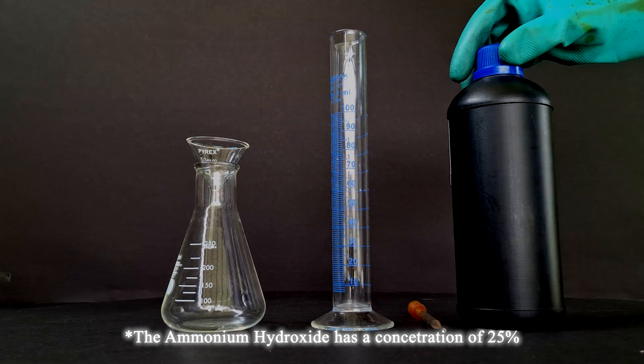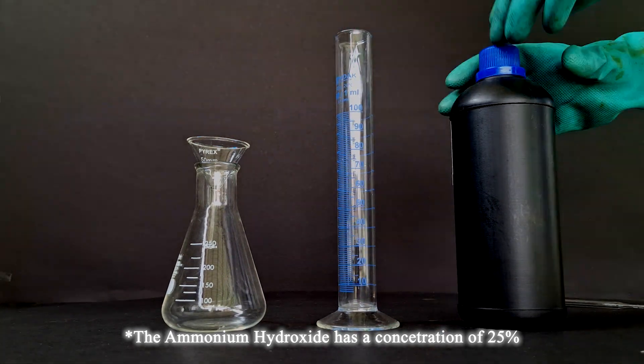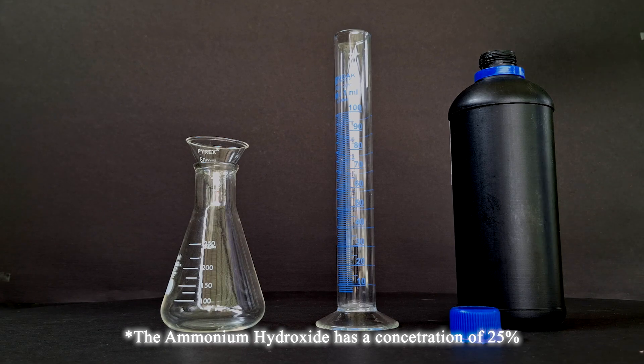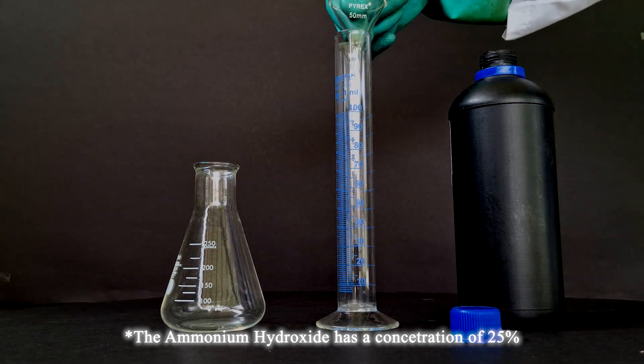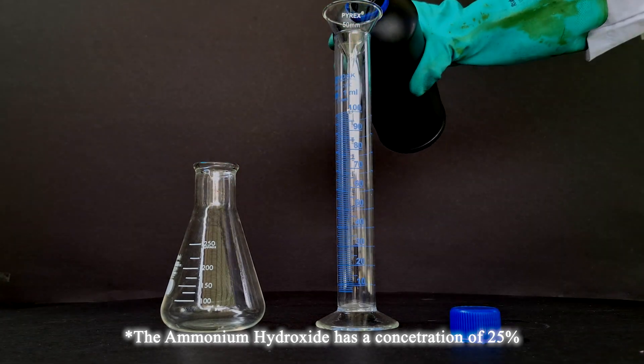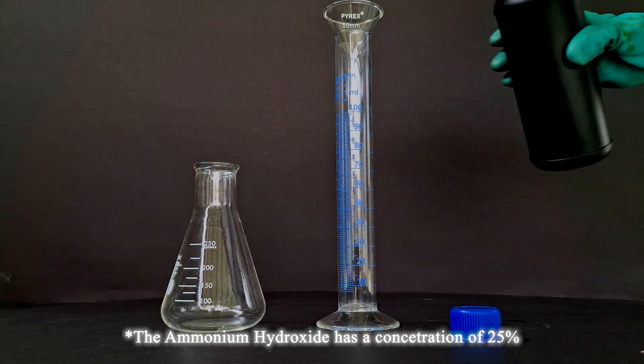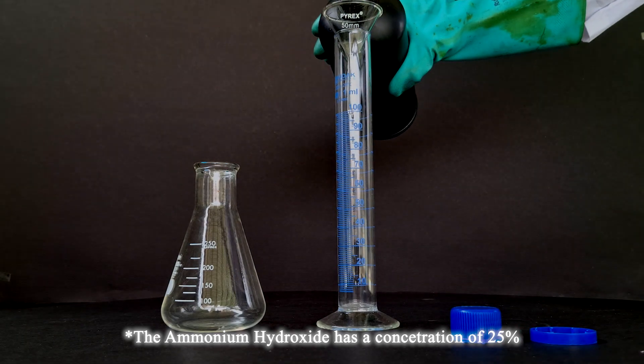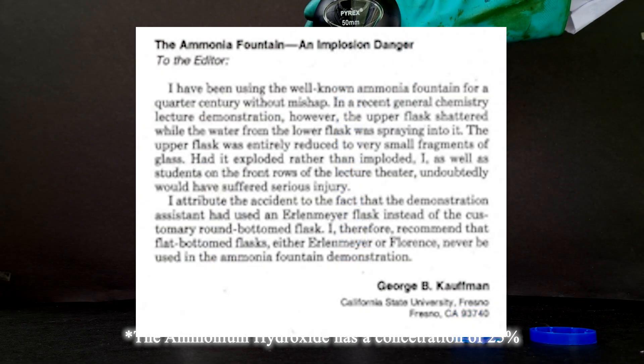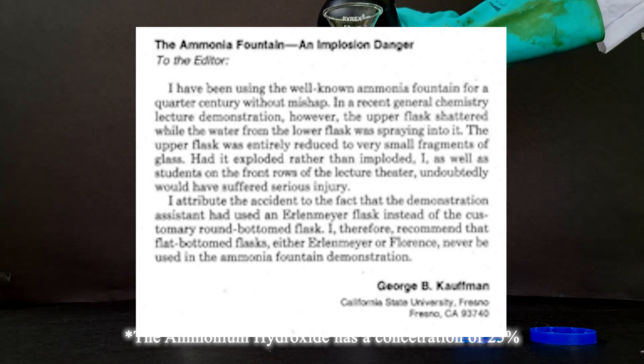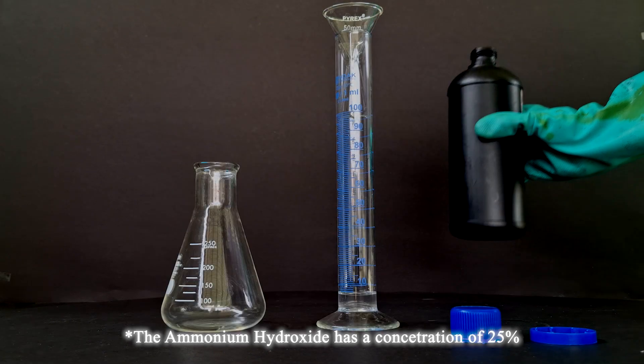This time, we are going to swap the places of the flasks. The Erlenmeyer will now be where ammonia gas is produced. However, whilst researching this experiment, I came across a research paper stating that the use of Erlenmeyers could be dangerous, and instead advised to use a boiling flask as an ammonia preparation chamber.